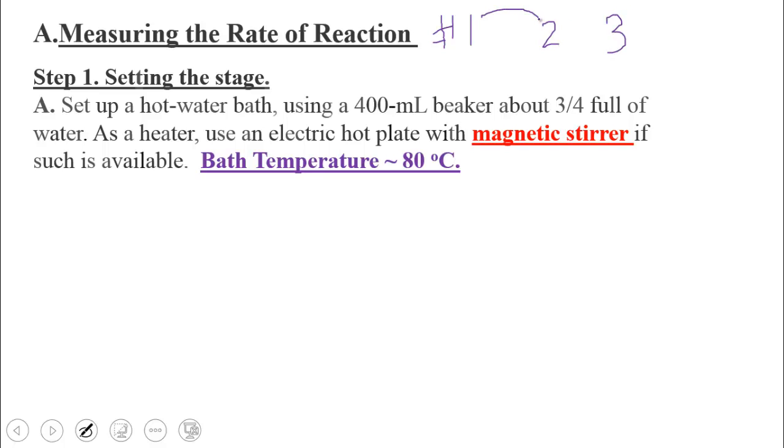In 1 and 2, we will change the concentration of the aspirin and see how the rate changes. So in class, remember, when you change the concentration of the reactant and see how the rate changes, you can find the order of the reaction from that data. And that's what we're going to do.